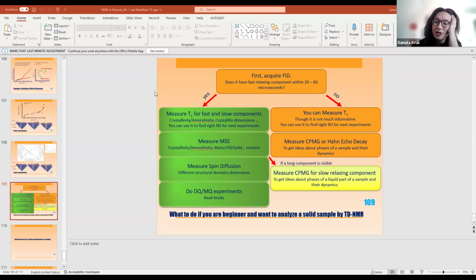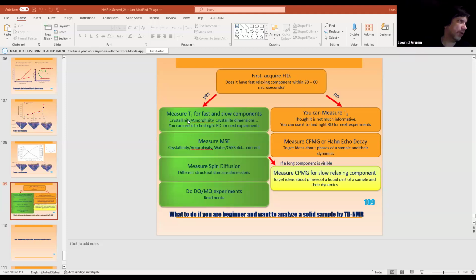Adriana, you said that for the partially deuterated molecule both are mono and bi-exponential. Do you mean T1 and T2, or just proton and fluorine relaxation? I do not know what Adriana has in mind. Does she want to say that?